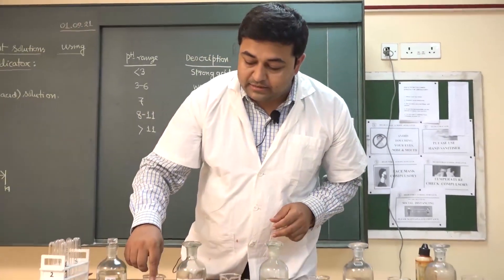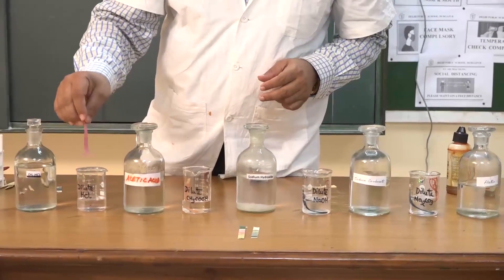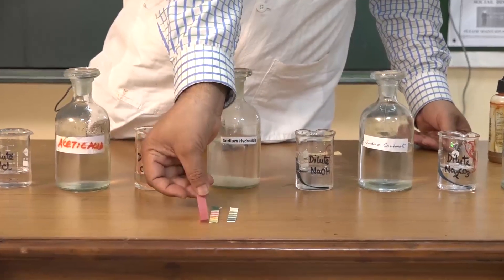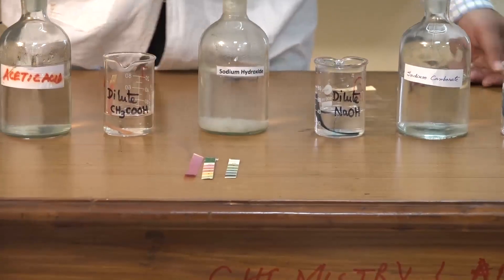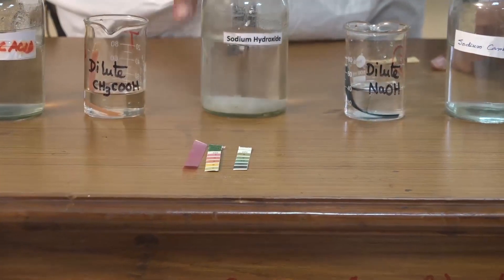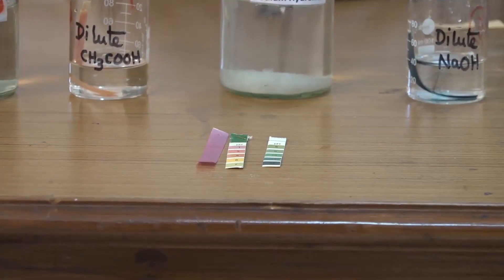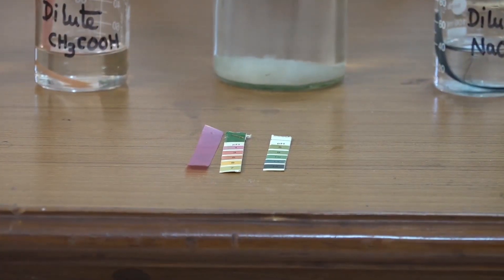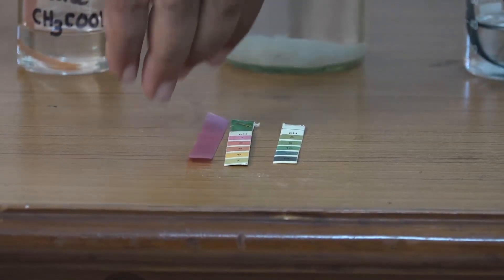I am collecting the pH paper from the hydrochloric acid solution and matching its color. The color is matching with almost the pH of 3. Since it is from hydrochloric acid and the pH is below 7, it means it is acidic in nature.